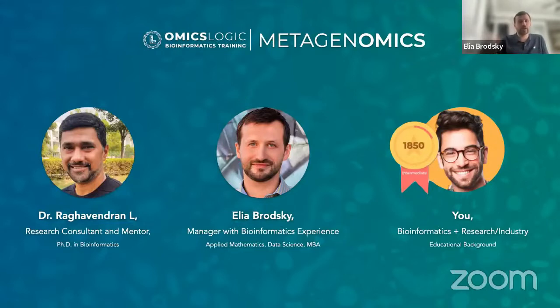So what we'll do today is I'll talk briefly about some of the basic things that you have to know about metagenomics. For some of you, this will be a review. For some of you, many things might be new, but I'll also point you to some resources on our portal where you can find important information either on the basic terms that we will use throughout the program, as well as some practical exercises that you can get started with.